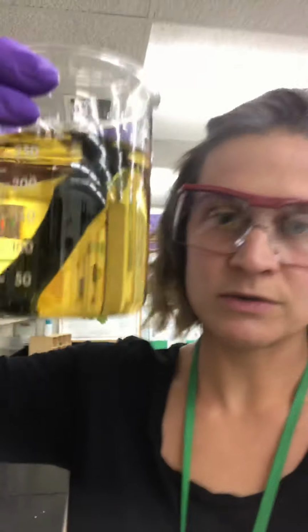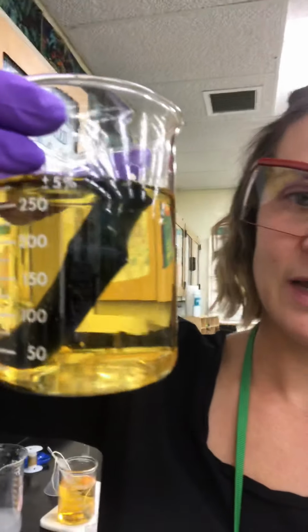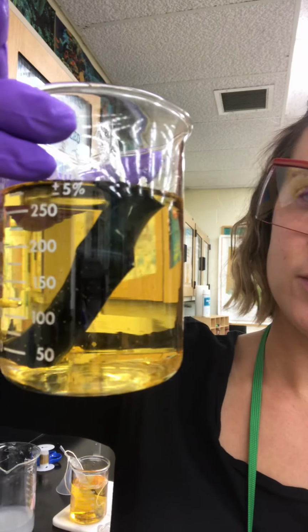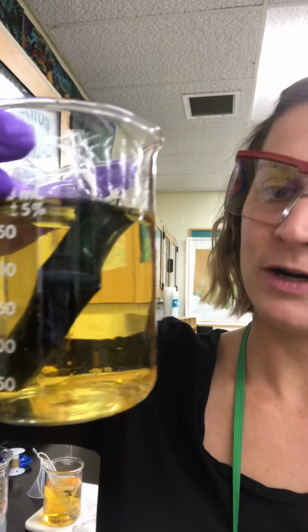So why did that happen? Well, water is going to move from greater to lower concentration, so the water is going to diffuse in towards the bag, in towards the solutes. So water is moving towards the solutes. And throughout the day, water continues to diffuse through until an equilibrium is reached, or the bag can no longer hold any more water.